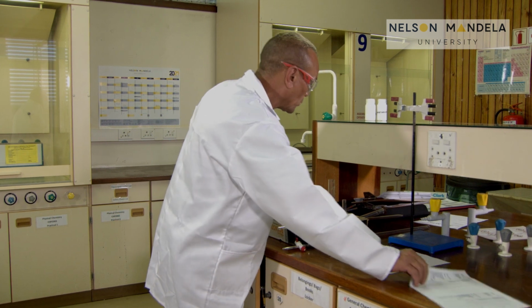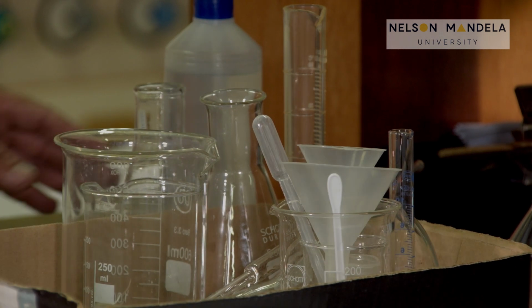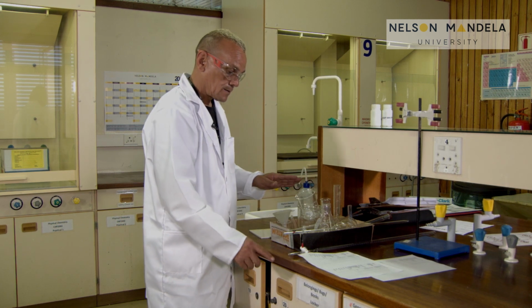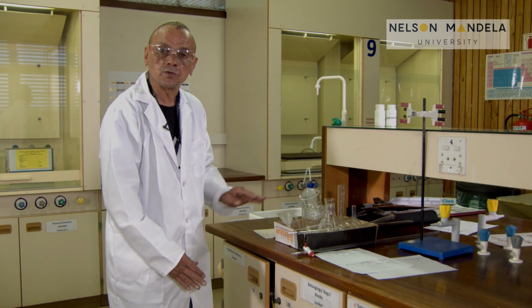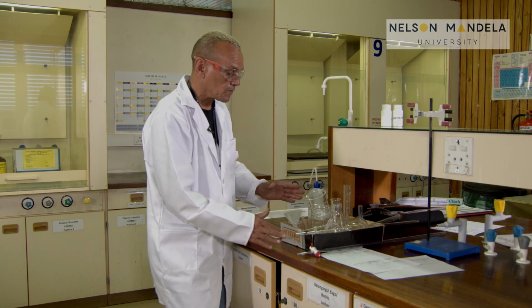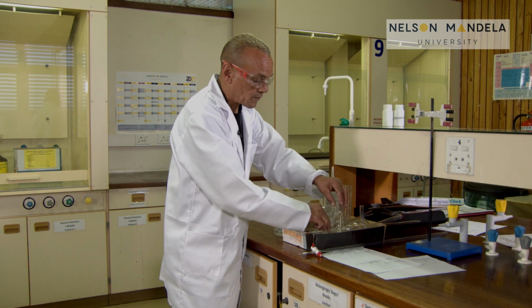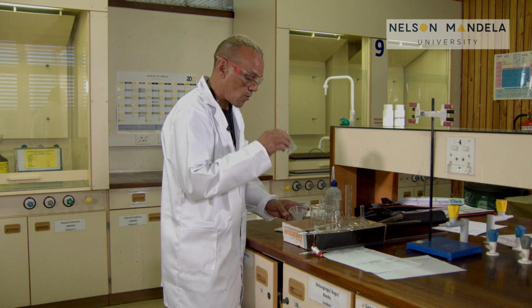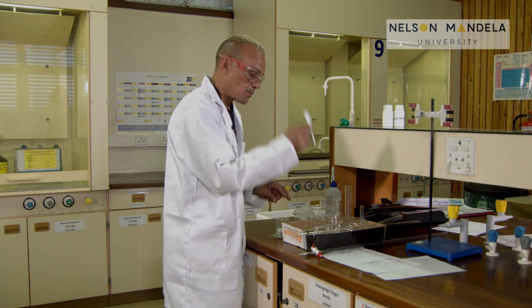Okay, what we do have here is glassware from the analytical locker, and we do have a variety of glassware as indicated. A PowerPoint presentation will be sent to you to identify this glassware and get used to it. It's not very easy to do as such, but inside your locker you will find glassware which consists of beakers. Just to mention a couple, you have conical flasks, smaller beakers, watch glasses, even a spoon spatula.